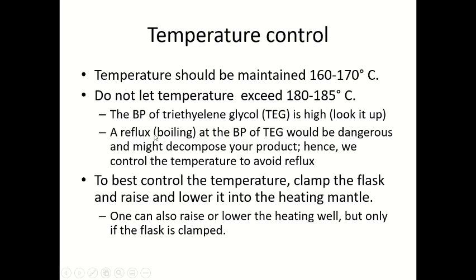and as we mentioned before, the boiling point of TEG is high, and a reflux, which means boiling, at the boiling point of TEG will be dangerous, as you may know, and might decompose your product. So we need to control the temperature to avoid the reflux.